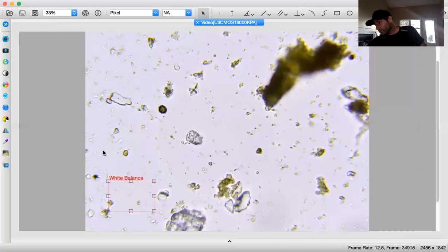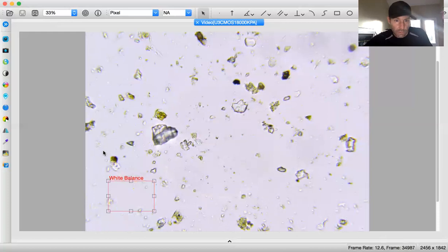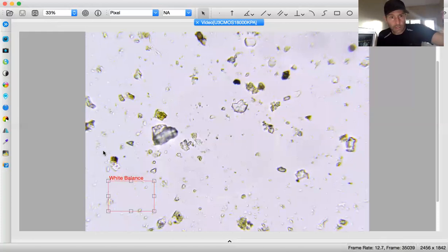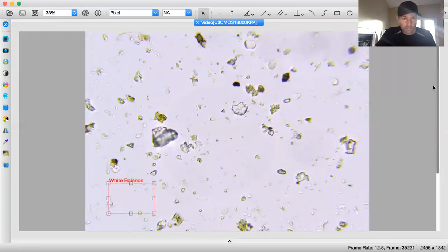Here we go. Man, that amoeba got me excited. Ooh, some actino in the top. Actino 1. You know that curves over because you can see the other side of it. And technically, I'm like 2 micrometers off on top and bottom. So, let's see that? So it does connect.